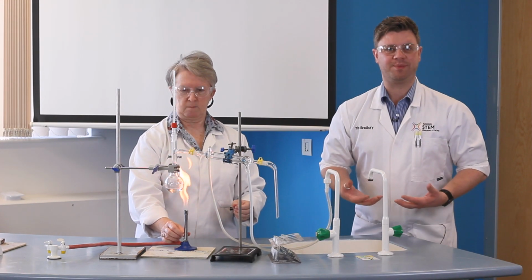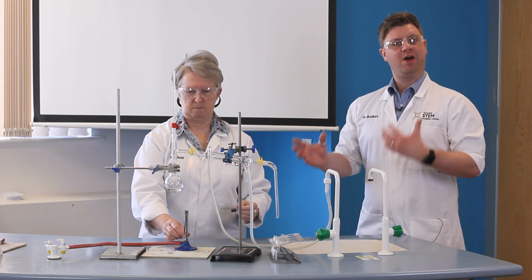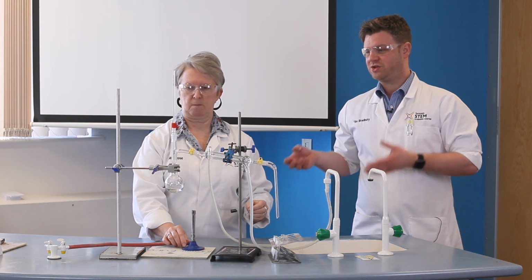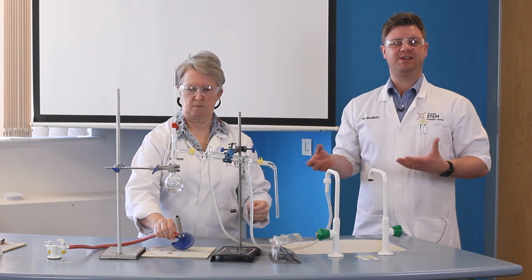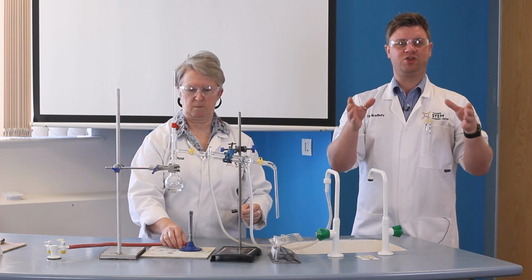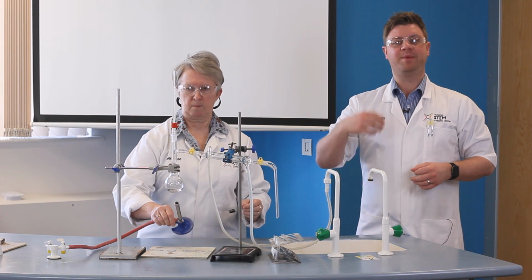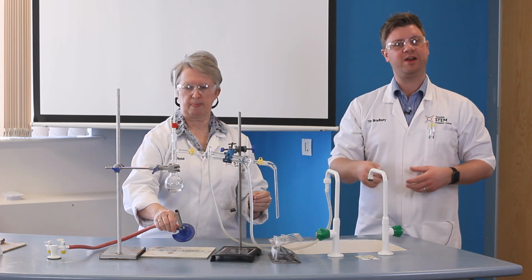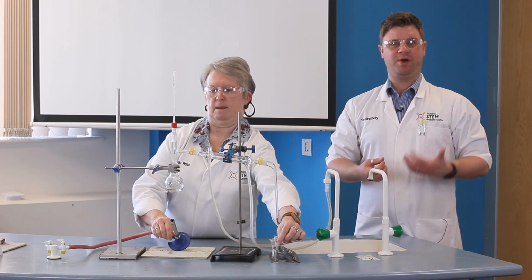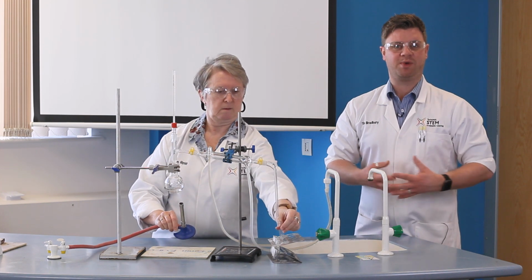So in this version of the demonstration, I've asked one of our lab technicians to undertake the practical side of the experiment for me. So Helen's going to start off the fractional distillation. What this means is that I can spend all of my time with my face forwards, making sure that I can see what the students are doing, checking their understanding. I'm able to ask them questions about the apparatus and techniques that we're using, and make sure they're understanding the purpose of the demonstration and the science behind what's going on.